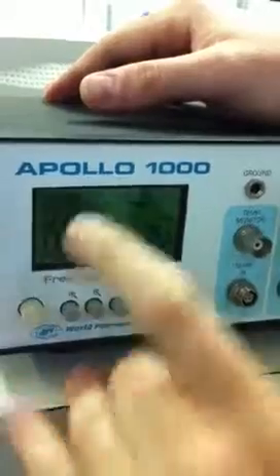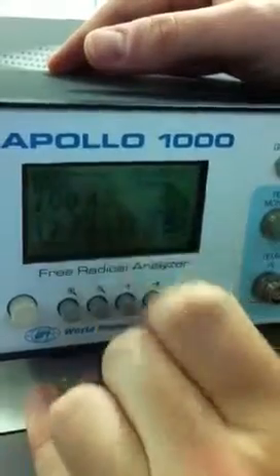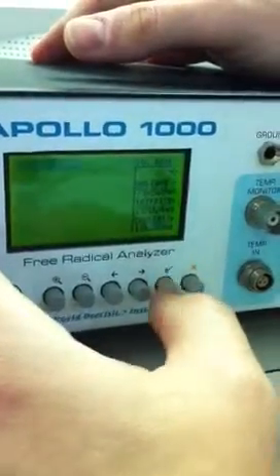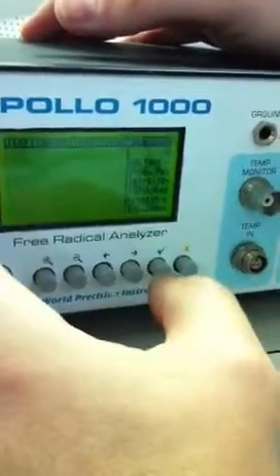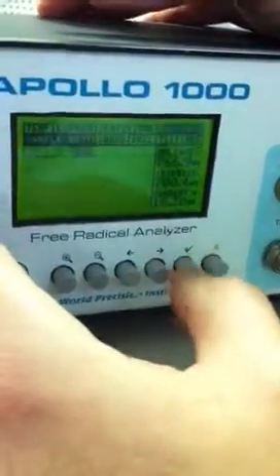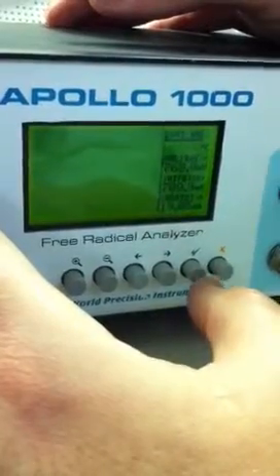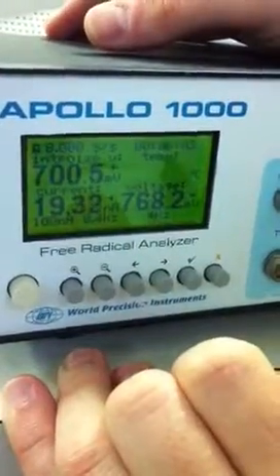Right now, one of the other things that are here, this is the number of samples per second it's currently acquiring, which is 2. I want to change that based on the LabTrax data acquisition, so I want to make that a little bit more frequent. If I go to options, I'm going to check that, and I'm going to scroll all the way over to sample rate. Highlight that. I want to set this a little higher for 8 samples per second. So we get a little bit more data. And I'll close out. So now we've changed it to 8 samples per second here.